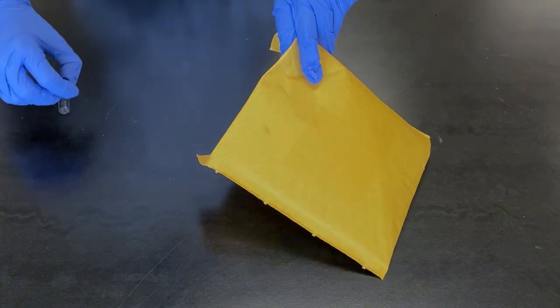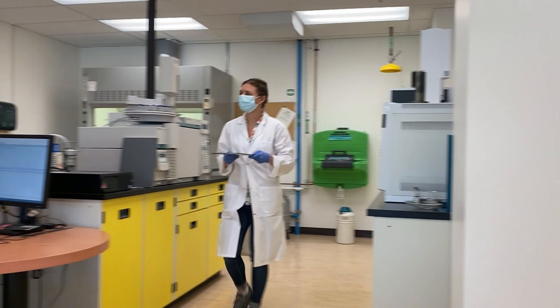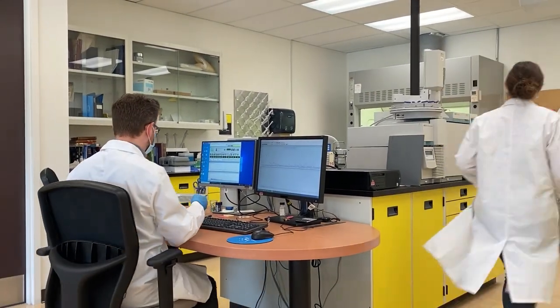Once your sample arrives at CCI, we will evaluate the material to ensure that it's appropriate for the various types of analysis required to answer your questions.